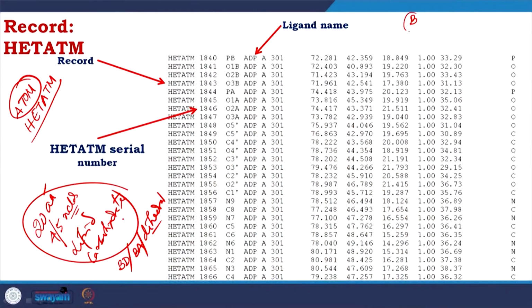Suppose you are designing a new drug, you include boron as a part of the molecule. How would the library understand that? If the library had to cover all your imagination, then the library should include all the chemistry, which is literally impossible. You understand? So, atoms are the standard molecules which are depicted here.